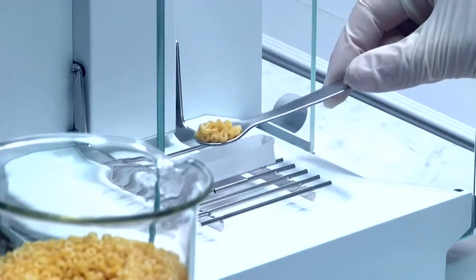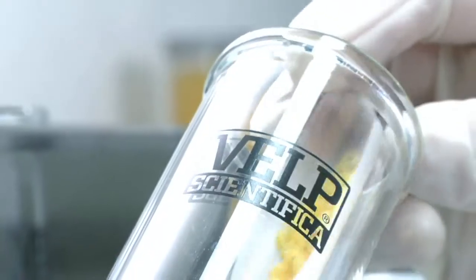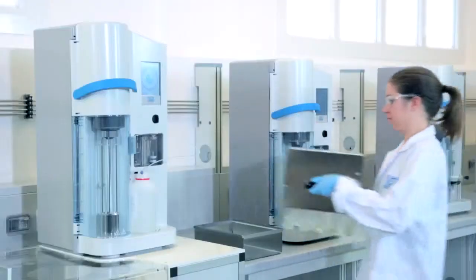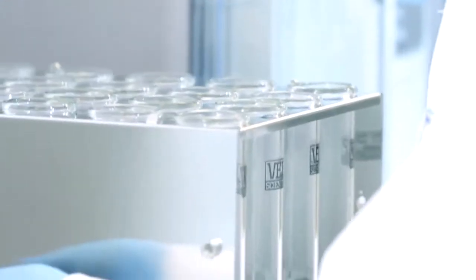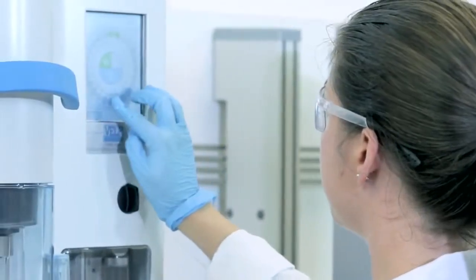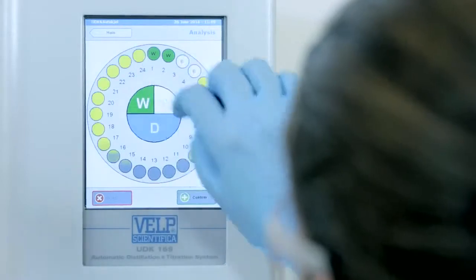Kjeldahl analysis is ideal for solid, semi-solid and liquid samples. Homogenize the sample completely, weigh and transfer it into a VELP glass test tube as specified by the official method. Sample weight can be registered directly from the balance.